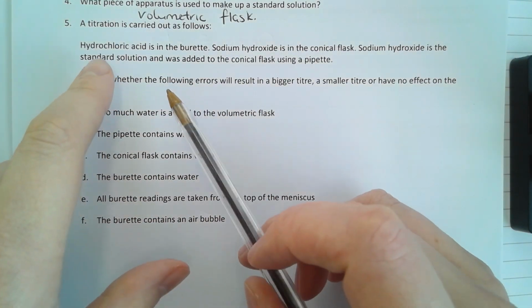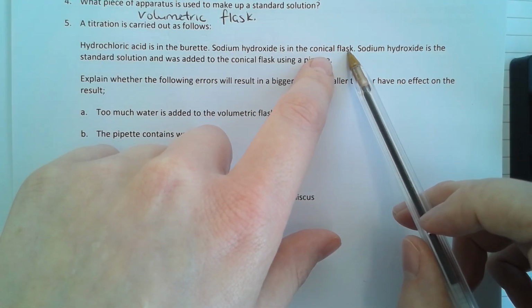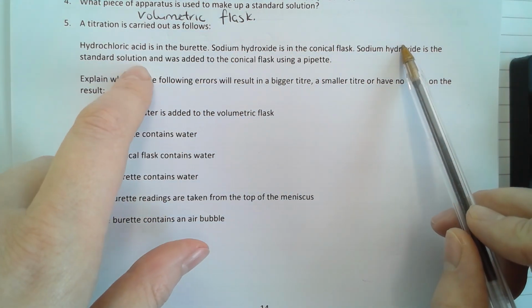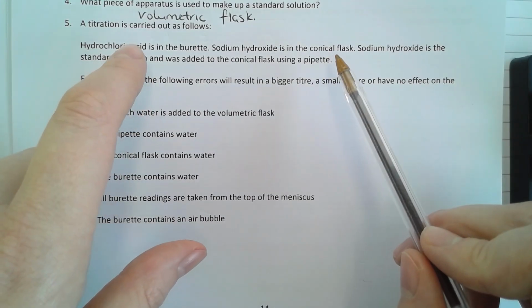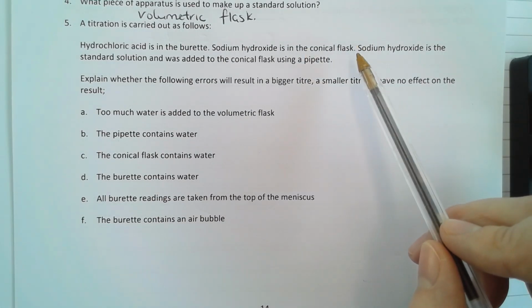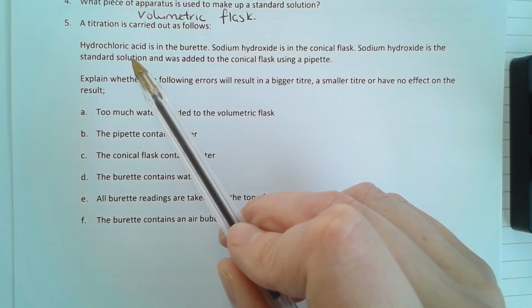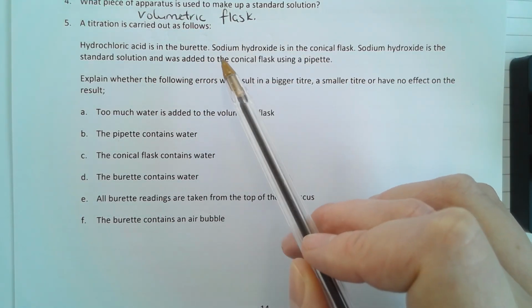So I've given you a scenario here. You've got your acid in the burette, you've got your sodium hydroxide in the conical flask, and your sodium hydroxide is your standard solution, which means you added it using a pipette. You do need to make sure that the standard solution is in the conical flask. Sometimes they can put the standard solution in the burette, so make sure you read the context that you are given.